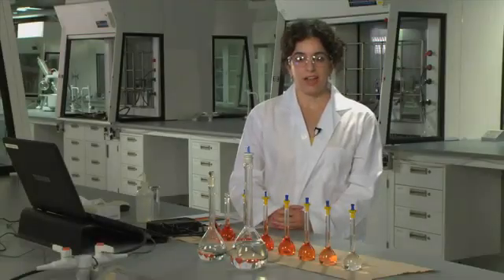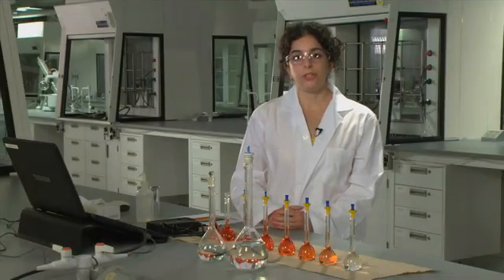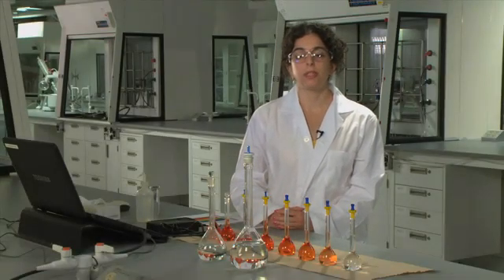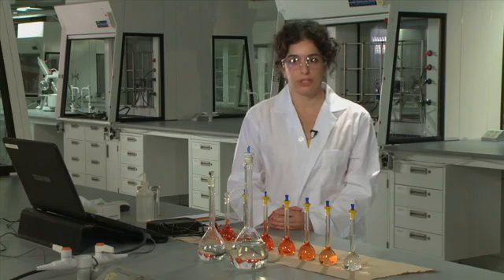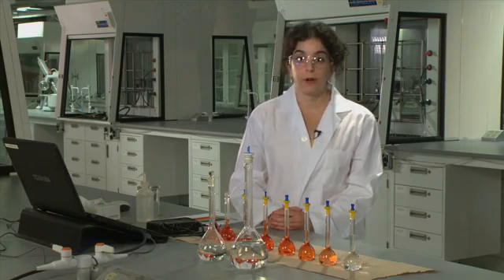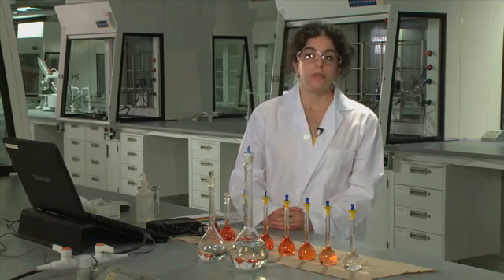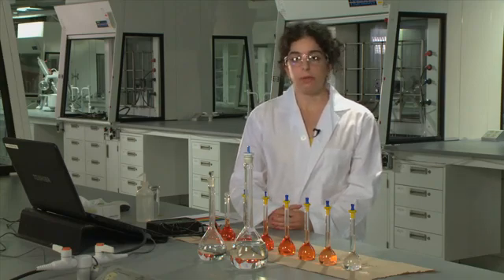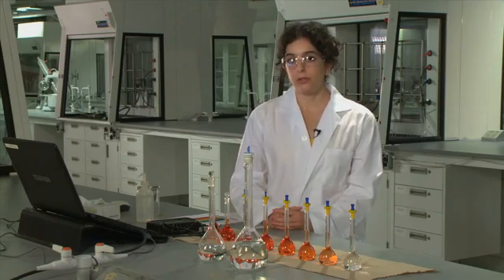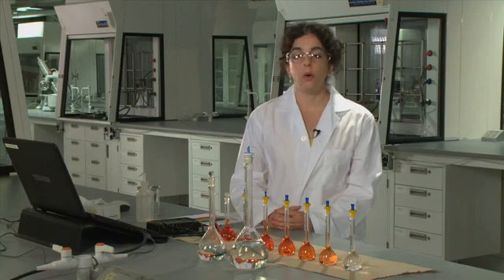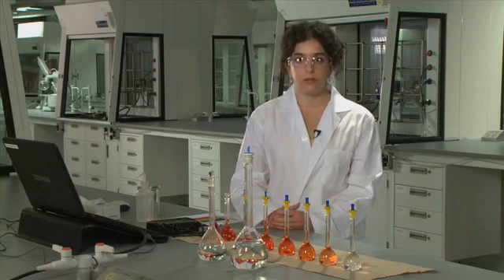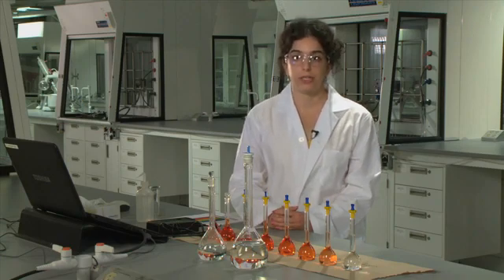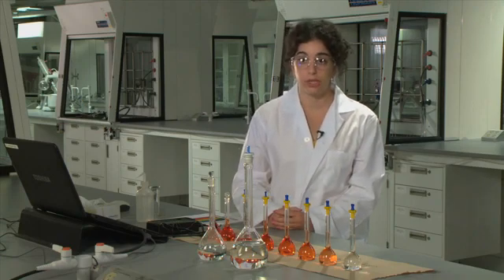Hi, my name is Amanda, and today I'll be talking to you about the experiment Spectrophotometric Determination of Iron. In this experiment, you'll be applying the Beer-Lambert Law to quantify the amount of iron contained in an unknown sample.